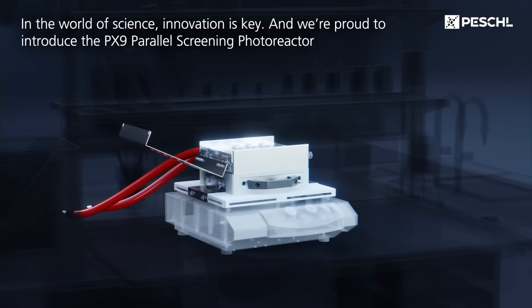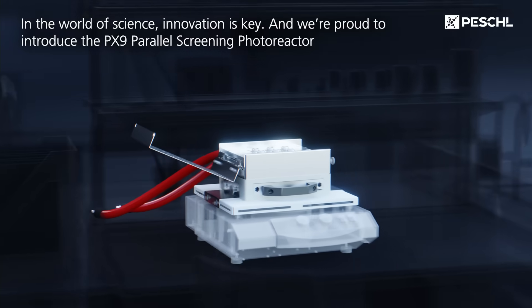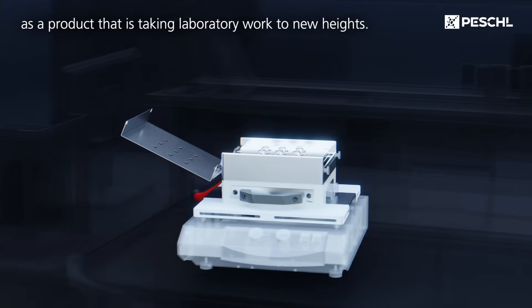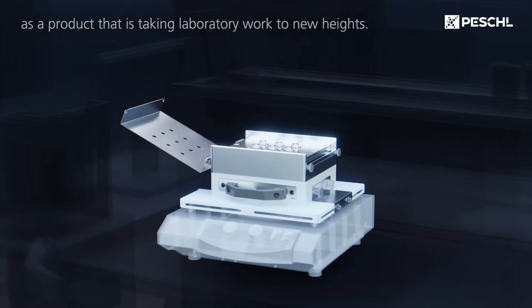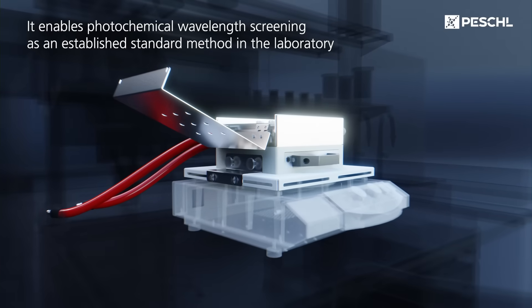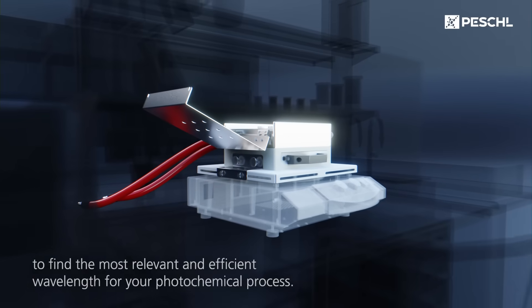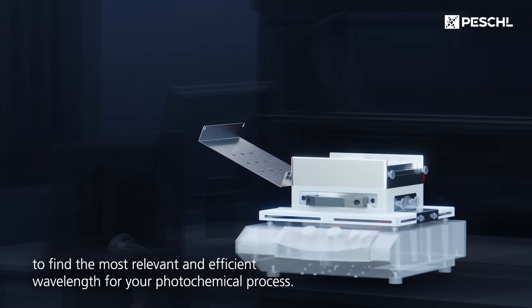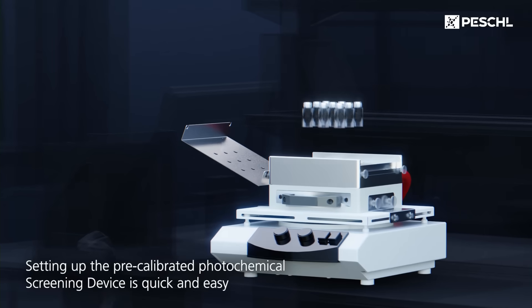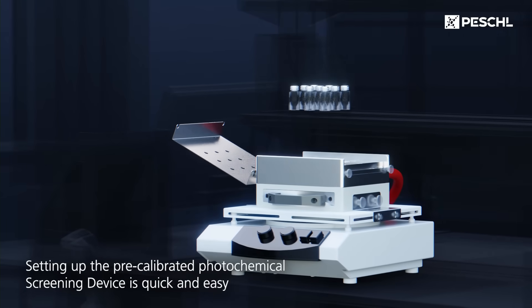In the world of science, innovation is key, and we're proud to introduce the PX9 Parallel Screening Photoreactor as a product that is taking laboratory work to new heights. It enables photochemical wavelength screening as an established standard method in the laboratory to find the most relevant and efficient wavelength for your photochemical process.